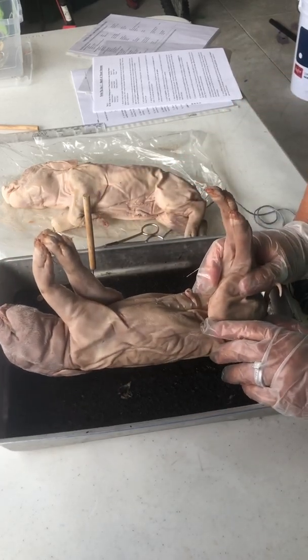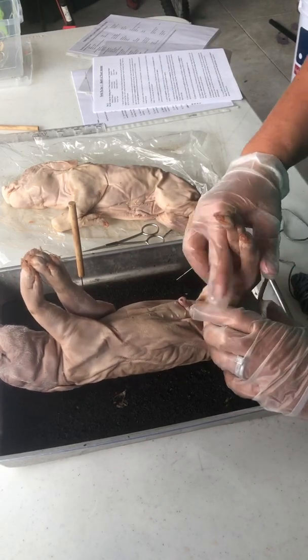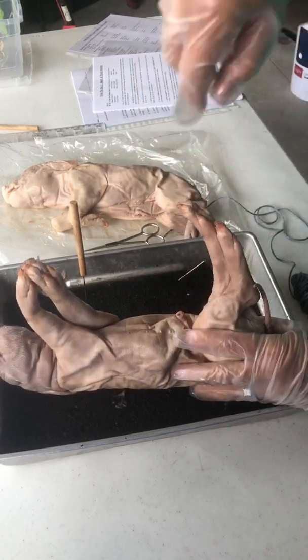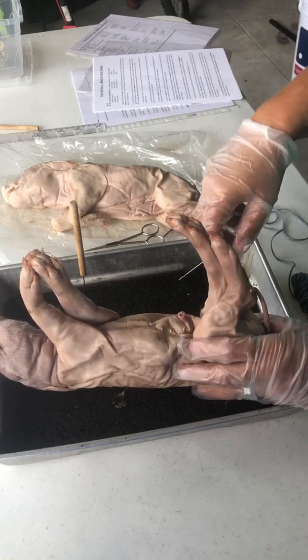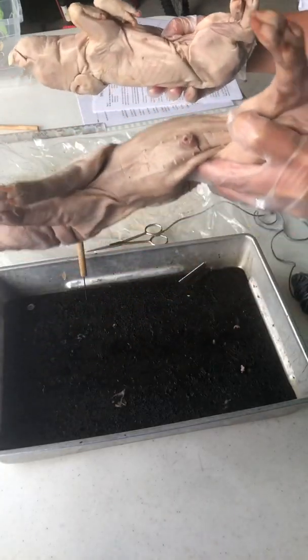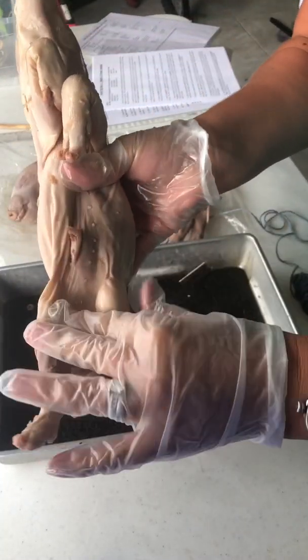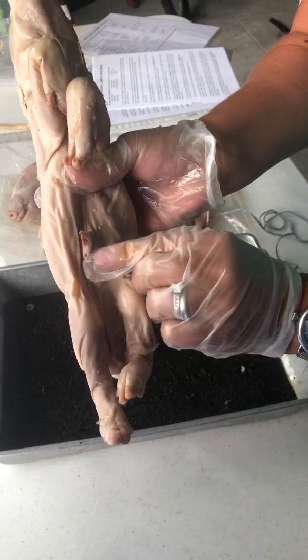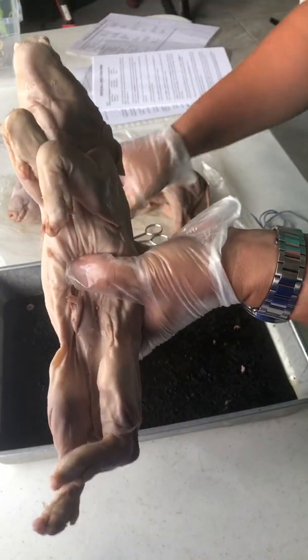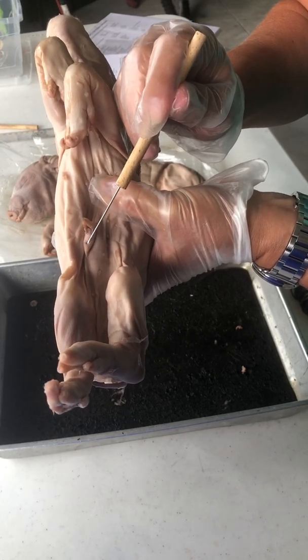Next, we're going to determine the sex of our pig by locating the urogenital opening through which liquid waste and reproductive cells pass. In the male, the opening is on the ventral surface of the pig, just posterior or below the umbilical cord. So this is a male. If you look right here, you can see the urogenital opening right here underneath the umbilical cord.